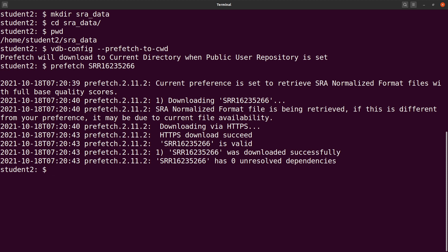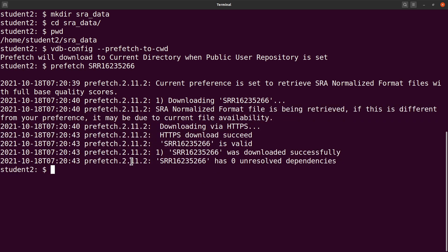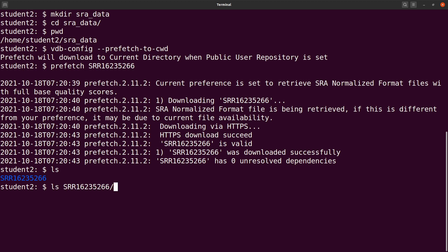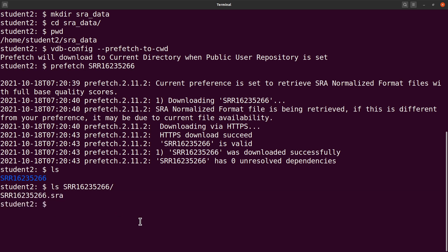So download has been done. If it's successful you will have this text being displayed here for you, and you also have some information here. Let's do an ls and you see a directory has been created. So in this directory you have the SRA file.